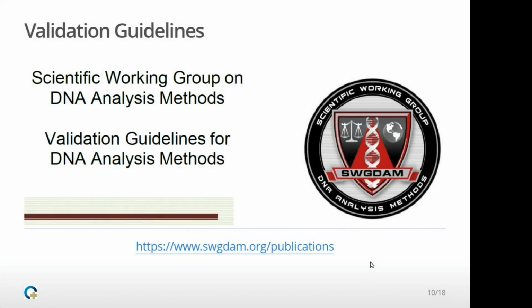In the US, they have the Scientific Working Group on DNA Analysis Methods and a guideline called Validation Guidelines for DNA Analysis Methods. And this document can be downloaded from the SWGDAM webpage.